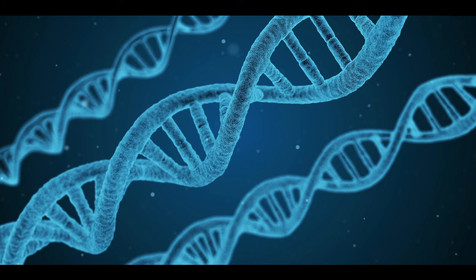No. SnapGene is literally just a program for reading and fixing chromatograms. I use Phylogeny, which is a website, which is very easy to use. You can also do phylogenetic trees straight off BLAST. And there are some very nice programs that cost money on which you can do them as well, but I'm poor, so I use the free resources.